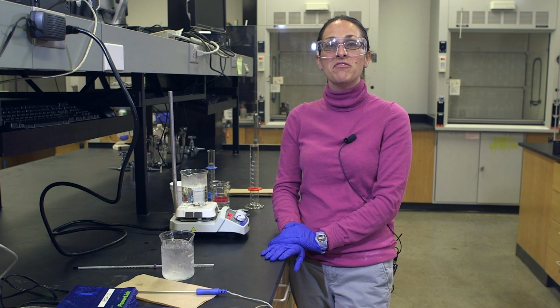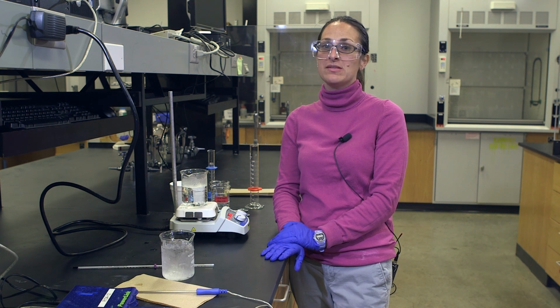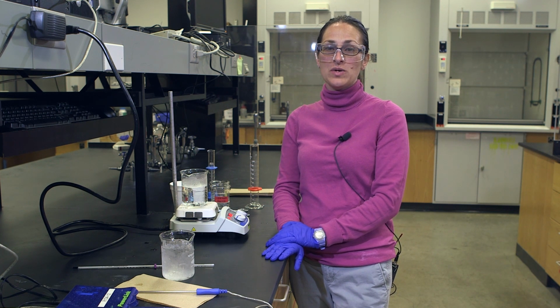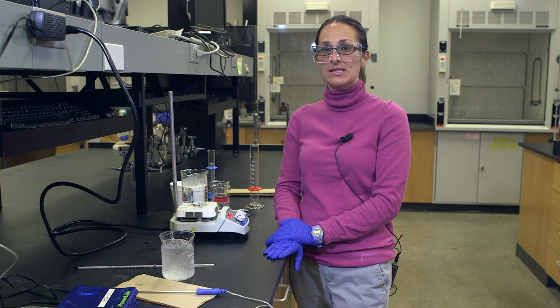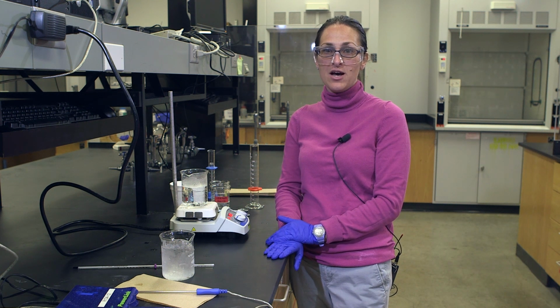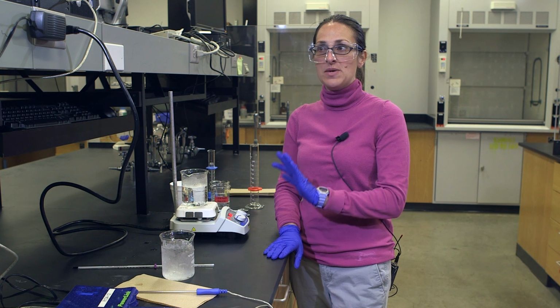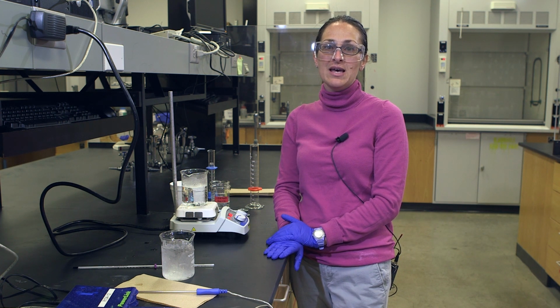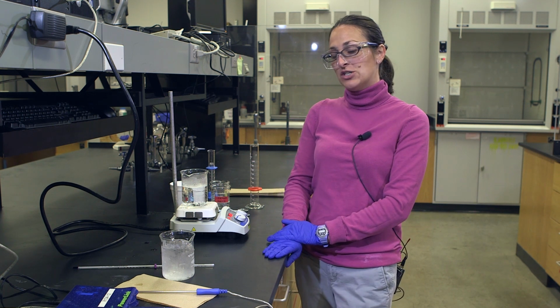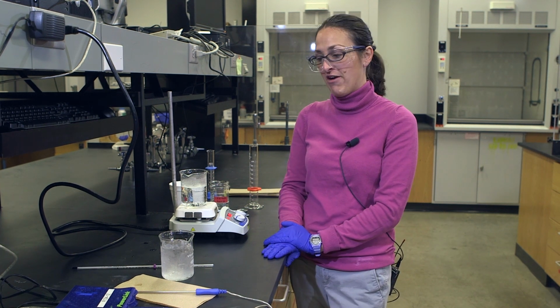For experiments 10 and 11, you're essentially using the same tools and techniques. So we're going to use one video to encompass the setup for both of those. And we're doing calorimetry. So we're doing two different calorimetry experiments. In experiment 10, we are investigating how to calculate the specific heat of a solution and metal, an unknown metal. Experiment 11 is determining the enthalpy of reactions, which I always think is really, really fun and interesting to determine whether something is exothermic or endothermic and to actually calculate what that value is.